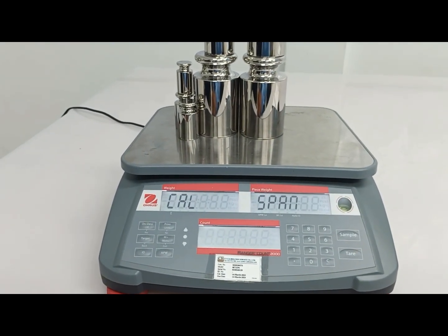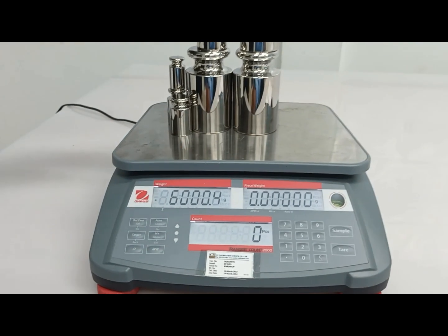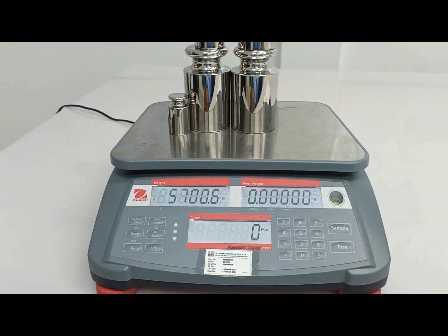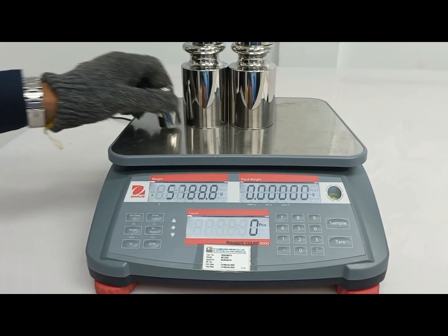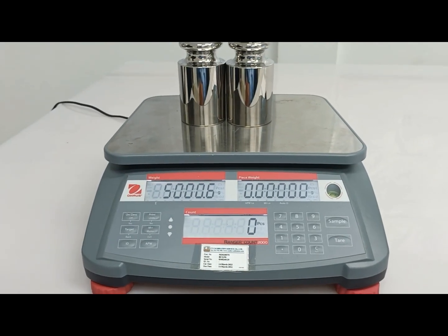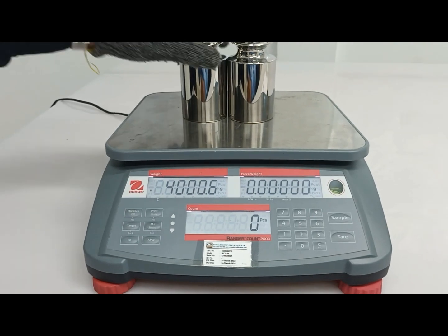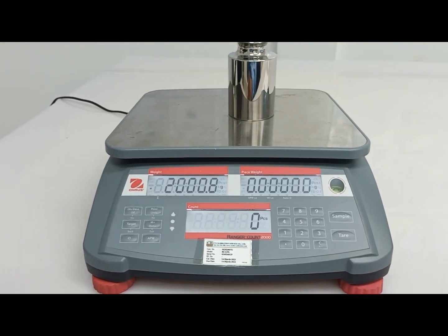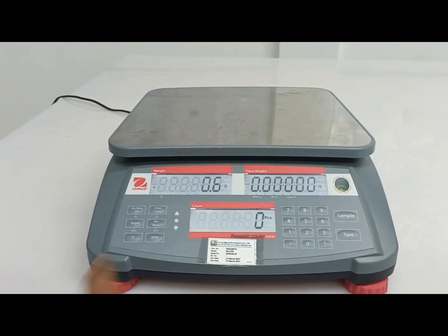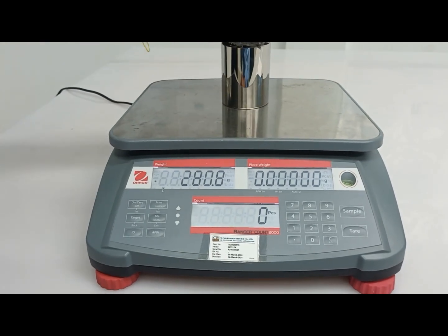Wait. We have done. I will remove the standard from the pan. I remove 2 kg. Let's press tare.